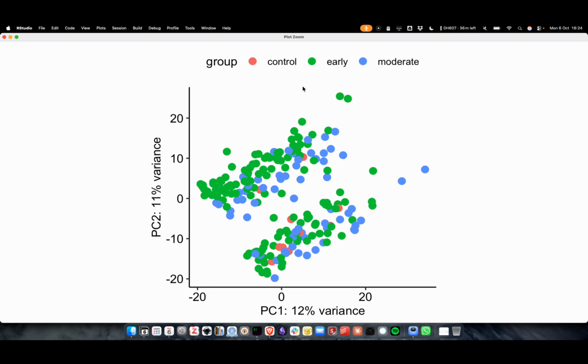So the original dimension: we started from some 19K genes into 216 samples, and here I am visualizing my 216 samples. Their original dimensionality is 19,000. There is no technique in this world which can help you visualize that. So even before I do the analysis, I can bring it down to a 2D or 3D picture, and the technique we are using is PCA. We will cover it quickly in class, what intuitively it tries to do. That's what you're seeing here.